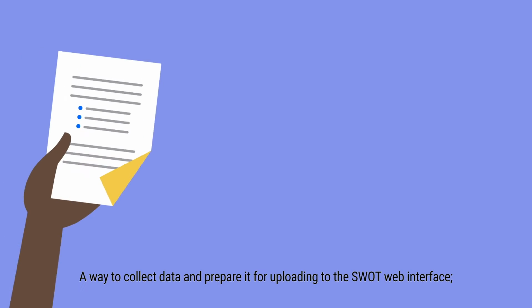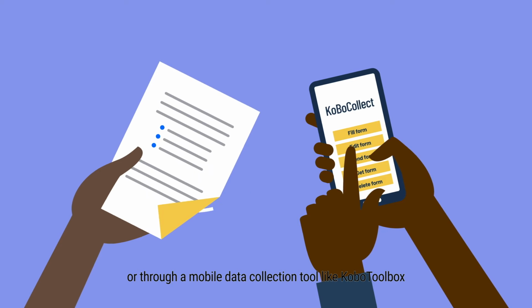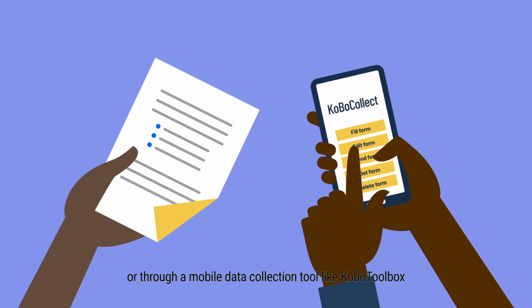A way to collect data and prepare it for uploading to the SWOT web interface, either manually or through a mobile data collection tool like Kobo Toolbox.